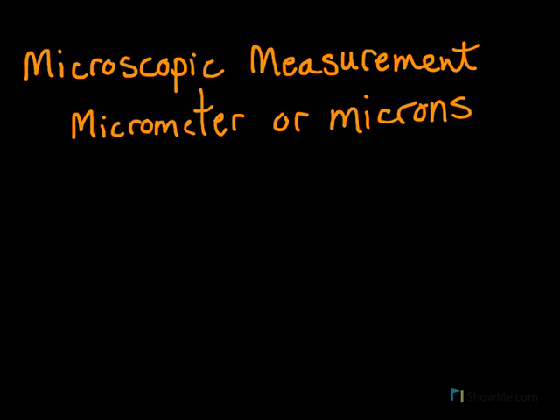The first thing we need to review, if you remember from a past video, is that the unit for measuring small things under microscopes, usually cells, is micrometers or microns. So what is a micron or a micrometer? First, let's review the units used for measuring microns. It is this little funny looking U and M. That's what you'll see on the Regents, a Greek symbol that looks like a funny U with a little extra line on it, and that's our unit.